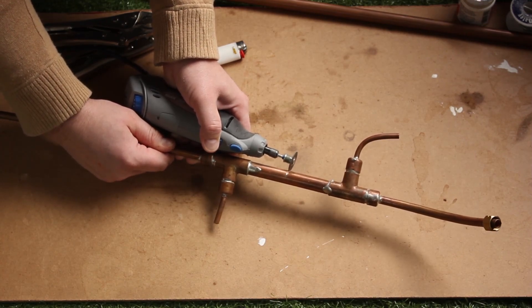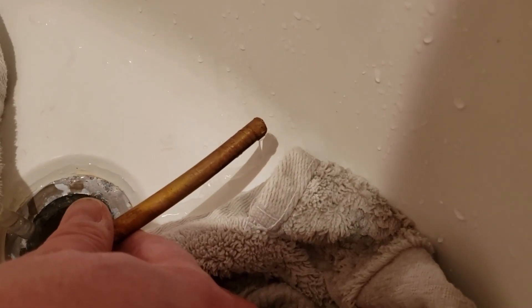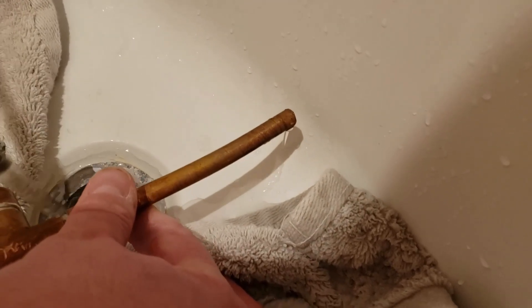When I pressure tested the water jacket, water was coming out where it shouldn't have. So we're going to have to make a repair — shown here in fast forward.